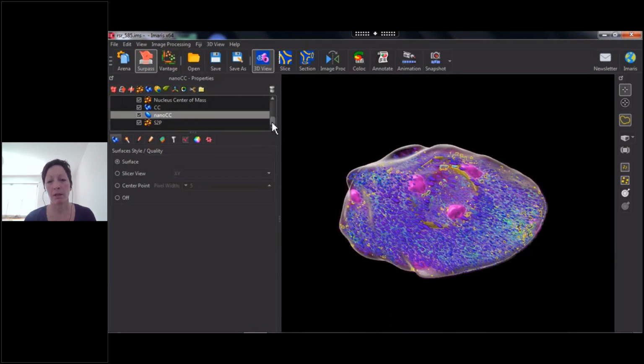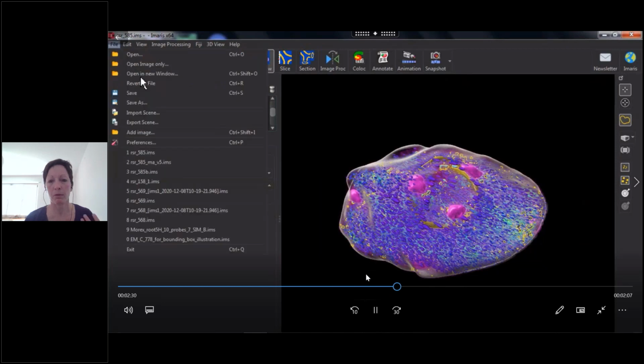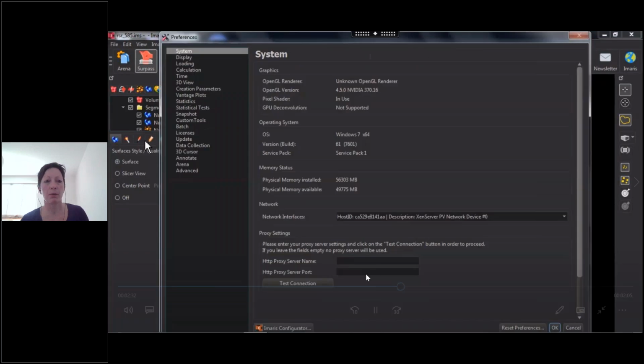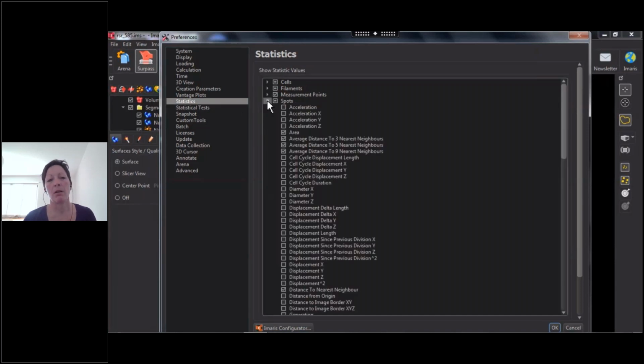Now, what you can immediately see is that, well, it's colorful, it's nice looking, but it's impossible to interpret by eye. So we definitely need a way to export and plot the data. Plotting the data is possible in IMARIS, but when you have a lot of image replicates, you cannot plot them all in IMARIS. So you need to have your own software, and that's what I'm going to show you.